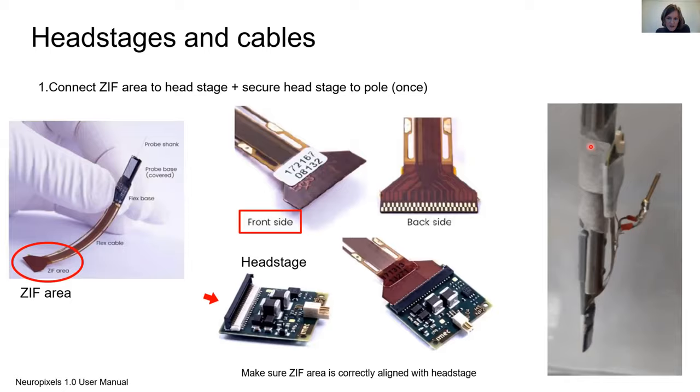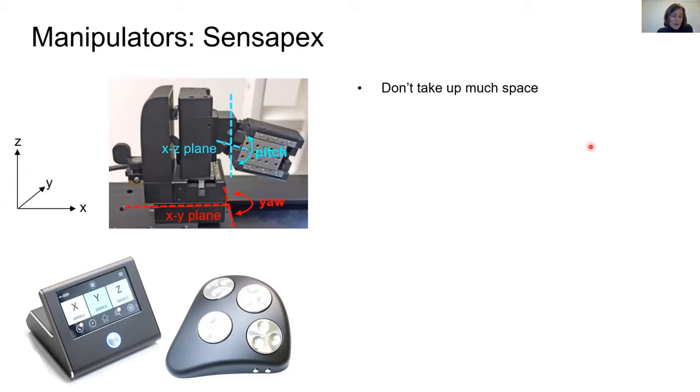Now we have our probe securely on the rod with the head stage. We want to put our probe into a manipulator so that you can micro manipulate the probe into the brain. What I used are manipulators by Sensapex. The advantages are that they do not take up that much space, so the footprint is quite small. They have four axes of movement: x, y, z and along the probe, which is important when you insert the probe into the brain. The movement range of each axis is 20 millimeters.